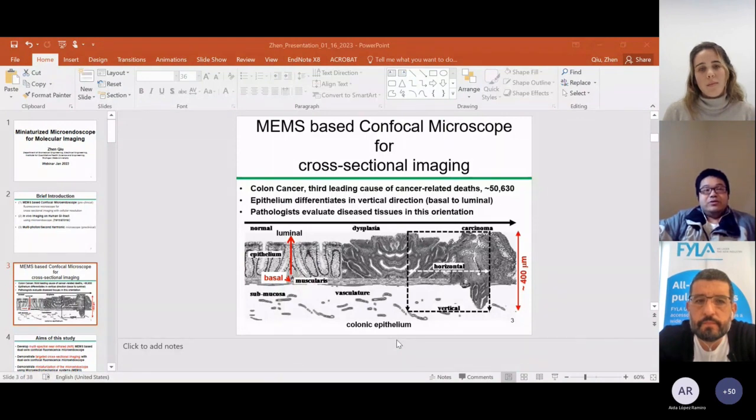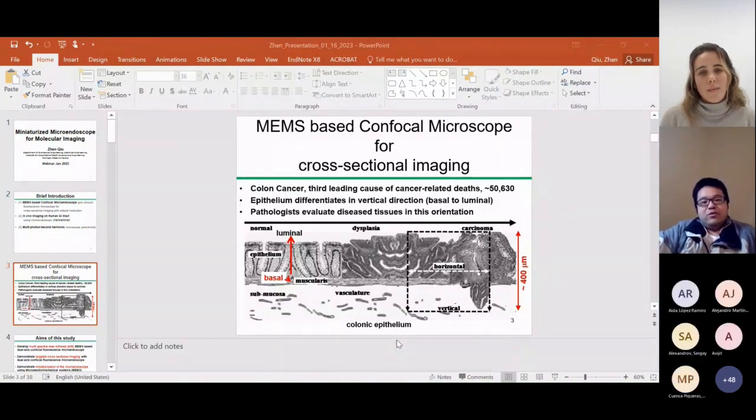So all you see is the fluorescence imaging. When you say noise, for example, using reflective confocal, you will see speckle, but this is not reflective confocal, it's fluorescent confocal. So the signal from the dye itself is very bright.